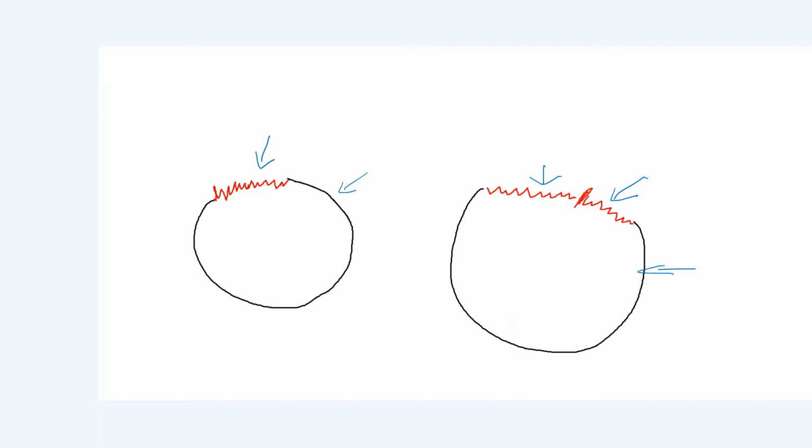So now the plasmid size in base pairs will be more. If this is 1,000 base pair and your plasmid is 4,000 base pair, now your plasmid should be 5,000 base pair. But if it is not right, then it will be 6,000 base pair in this case, because there will be 1,000, 1,000, and then 4,000. So it will be 6,000. So based on the size of the plasmid, you can tell if there is one gene of interest inserted or two genes of interest inserted.